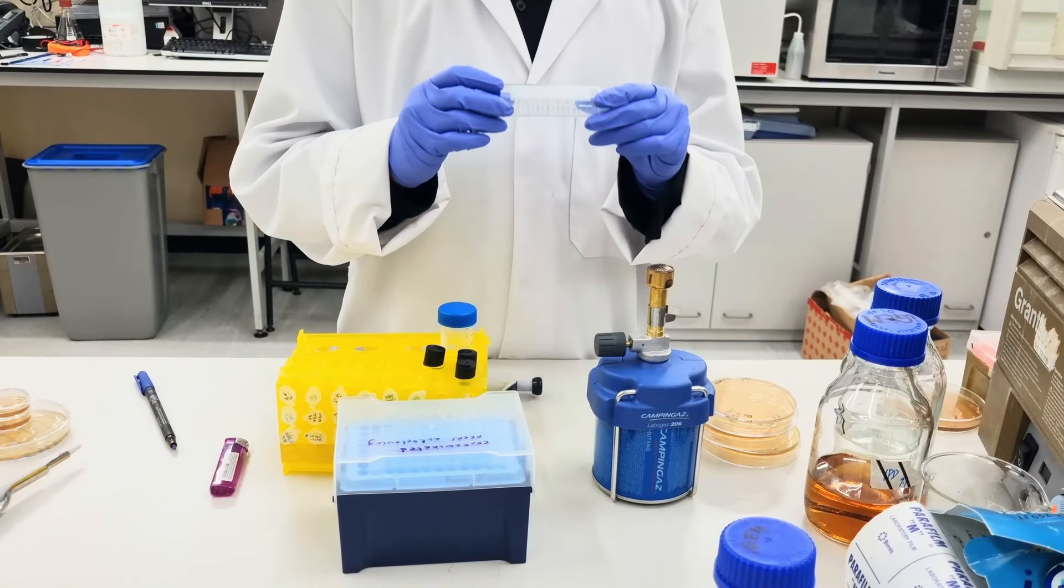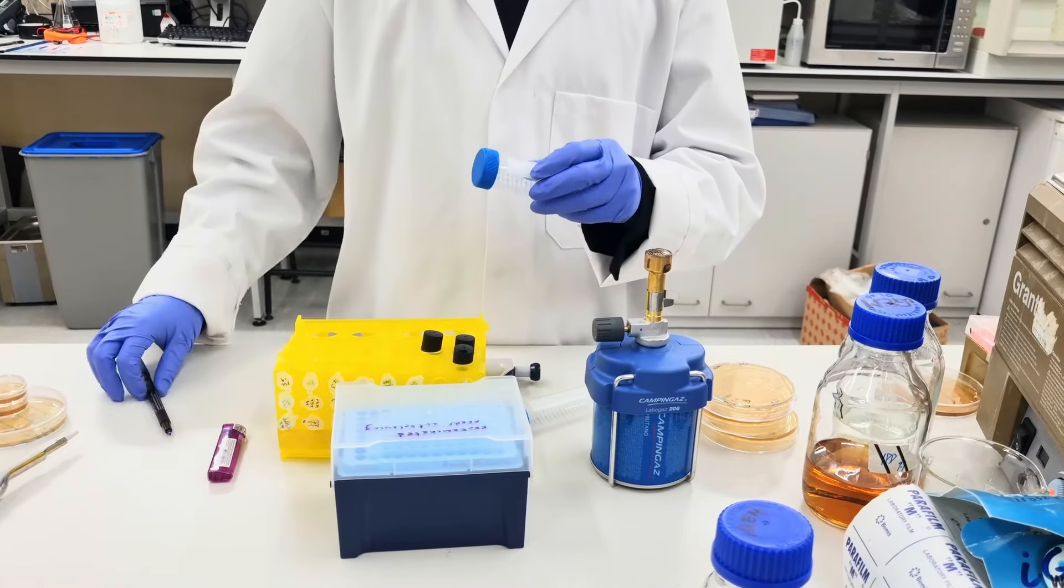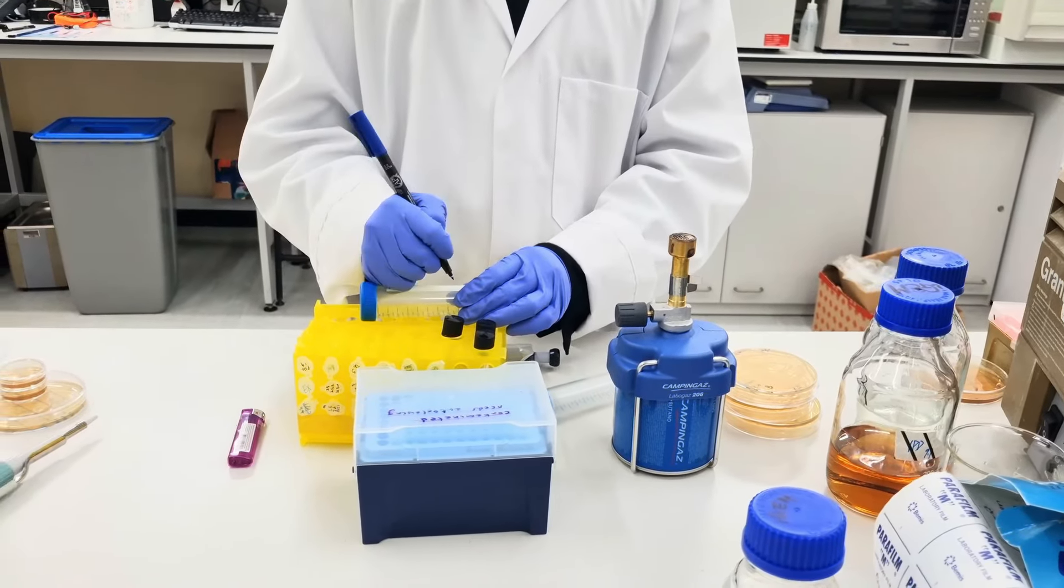The first step is to take two clean falcon tubes and label them with the names that you want to distinguish between other falcon tubes.